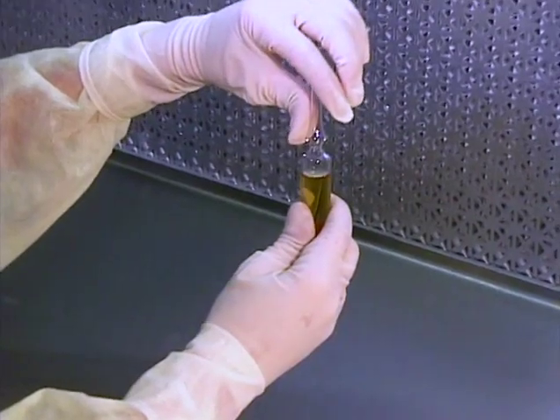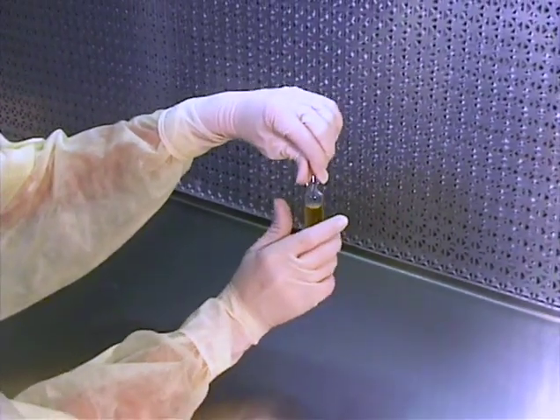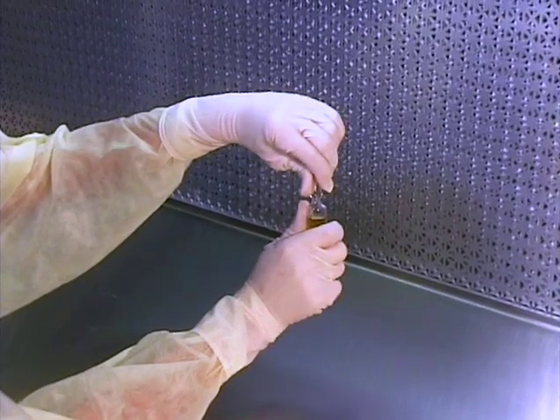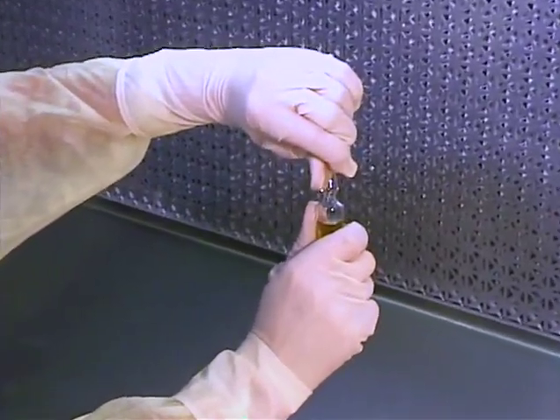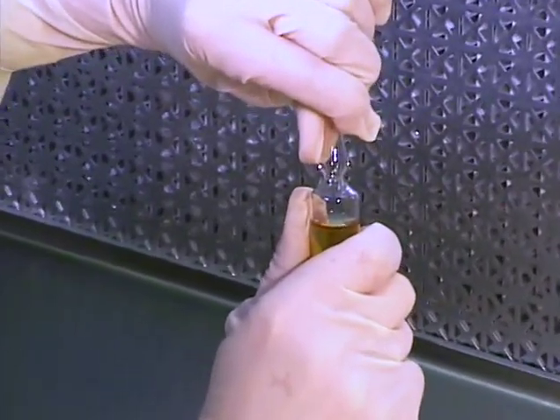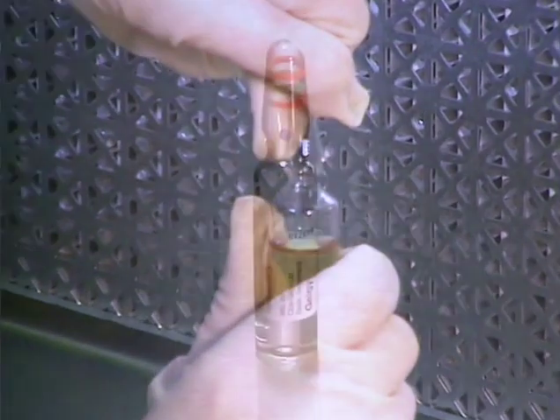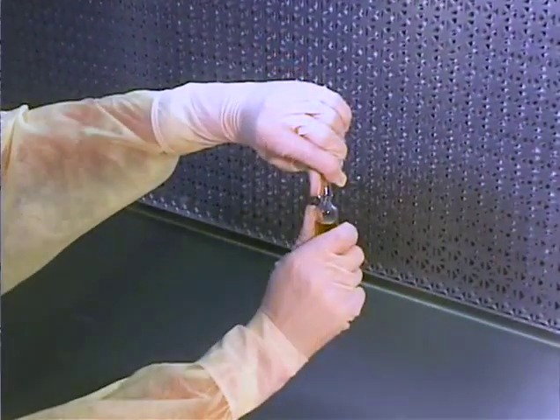Holding the ampule in an upright position, grasp the top in one hand, positioning the thumb just above the neck at the widest point of the top. Grasp the bottom of the ampule with the other hand, positioning the thumb just below the neck. Remember, some ampules are specially marked with small dots for proper thumb positioning. If these pressure points are not used, these ampules will not open.